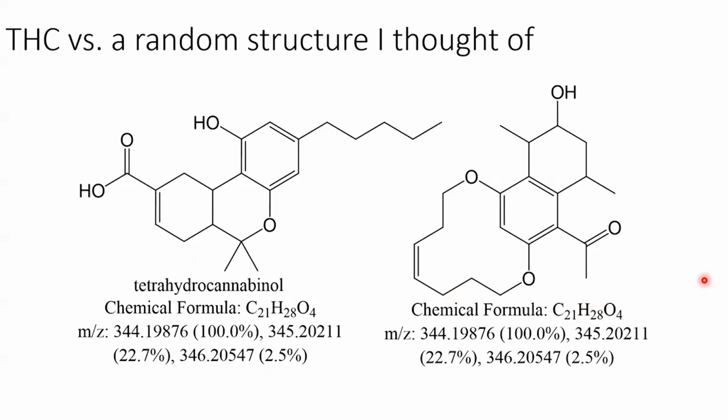It doesn't break any of the rules of chemistry, so, theoretically, this molecule could be made for all I know. But the point is that the chemical formula between these two species is identical, despite the structure being different. So this compound here, this is an illicit substance. As far as I know, this compound here is not illicit. There's nothing illegal about that substance.